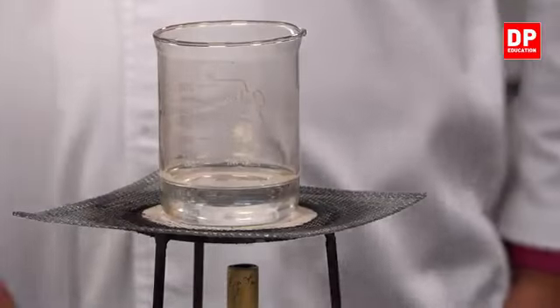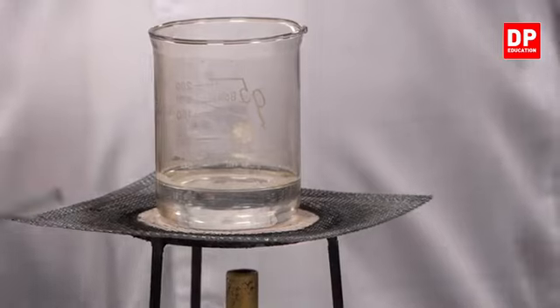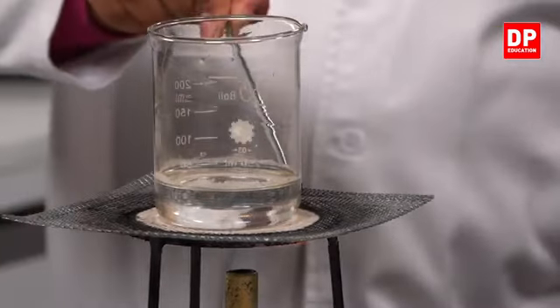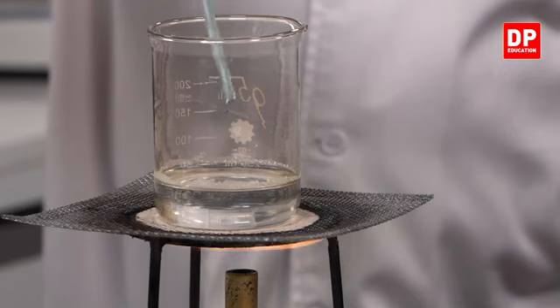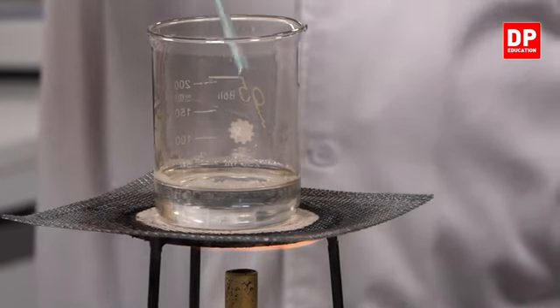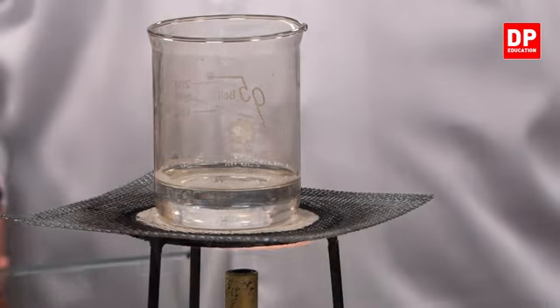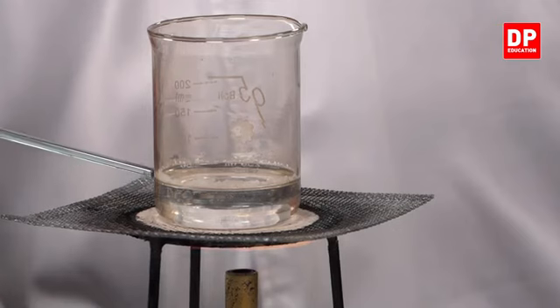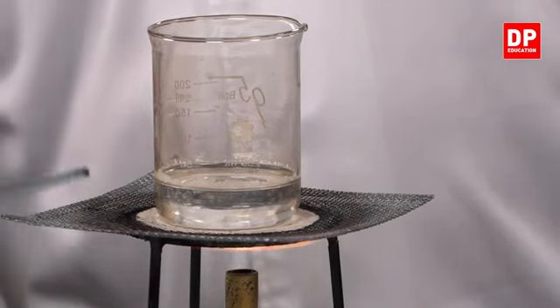Right, my dear children, now see the beaker is gradually heating up. And if you observe clearly, you can see there is some small bit of powder, like dust, getting deposited at the bottom of the beaker.